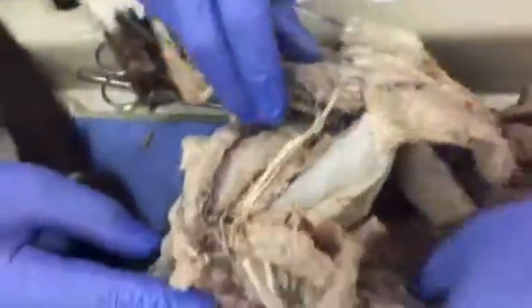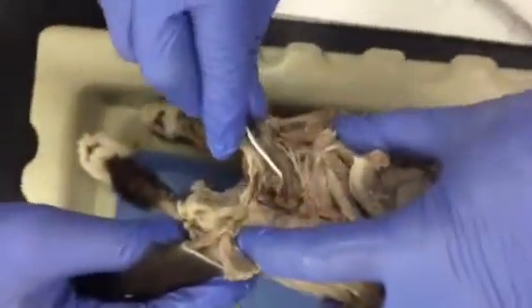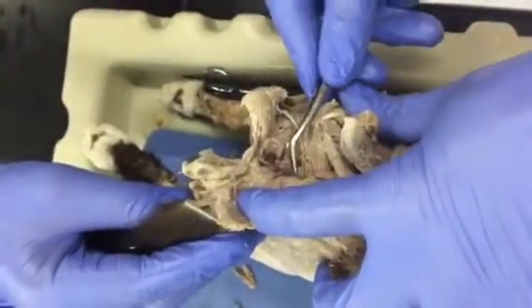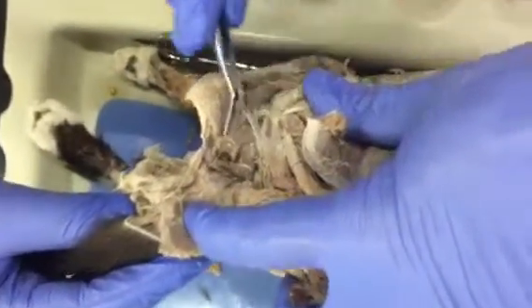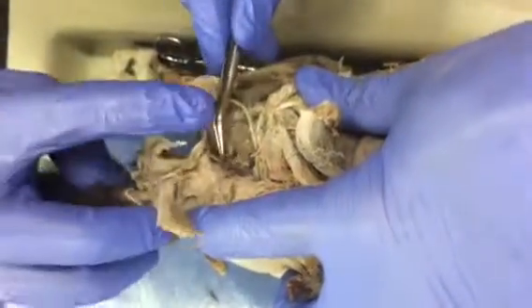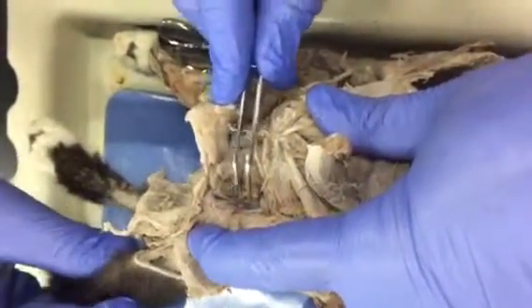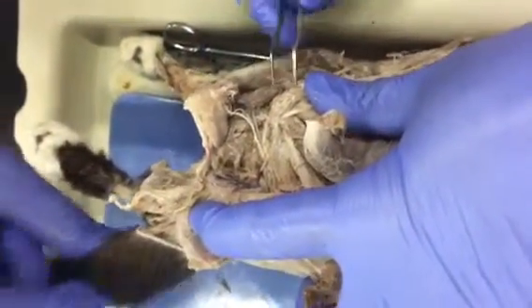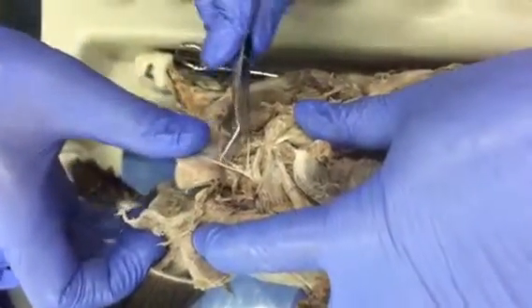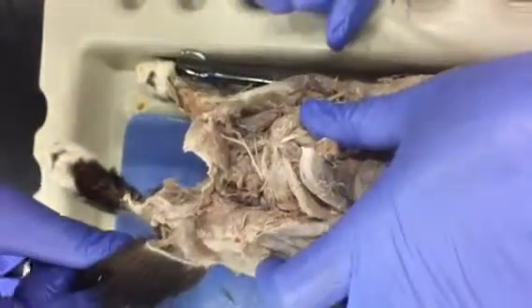Back here, you guys got to know these ones, the pudendal nerve. Do you have to know that? Pudendal. Gluteal. And we're thinking that this is your gluteal arteries and veins. And then the femoral cutaneous. Is it caudal femoral? Lateral femoral cutaneous is right here.